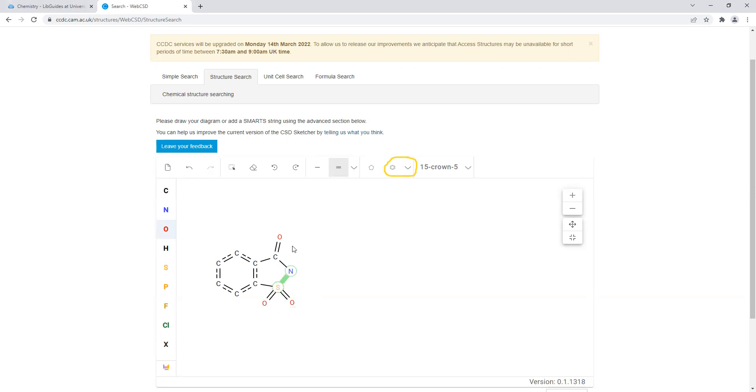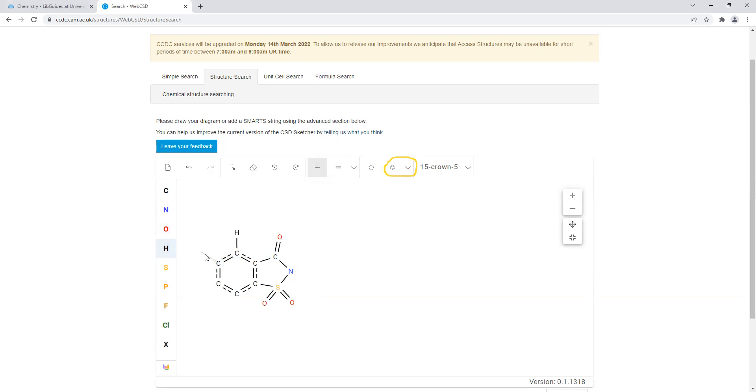To help minimize search results, we need to add some hydrogen atoms. So you click hydrogen, click single bond, and we're going to add hydrogen atoms to this. This is what your saccharinate ligand should look like.